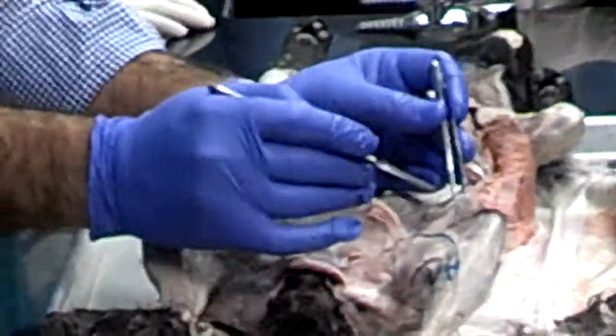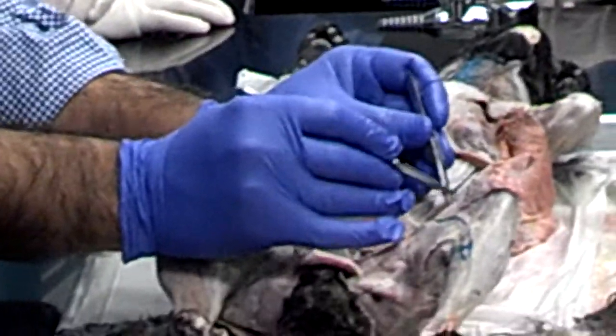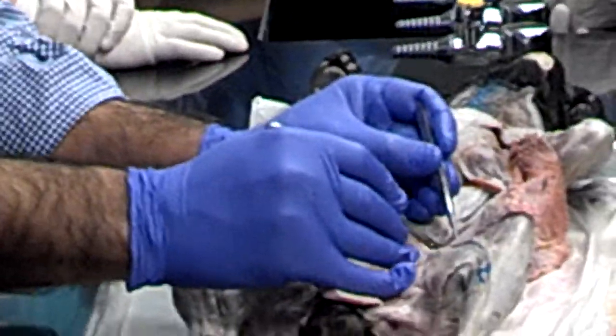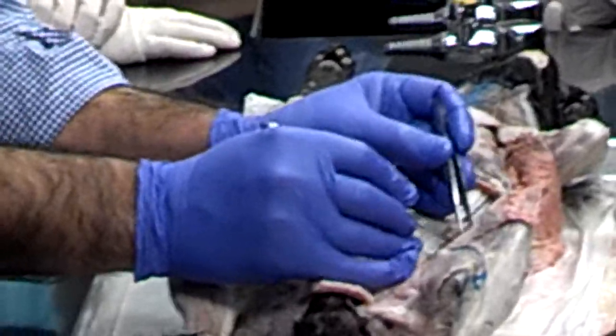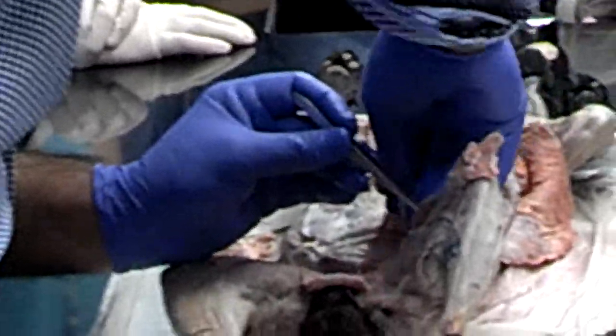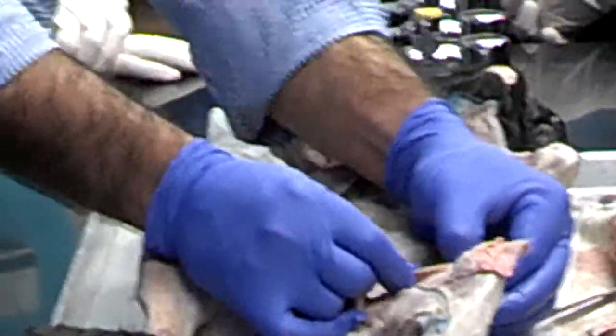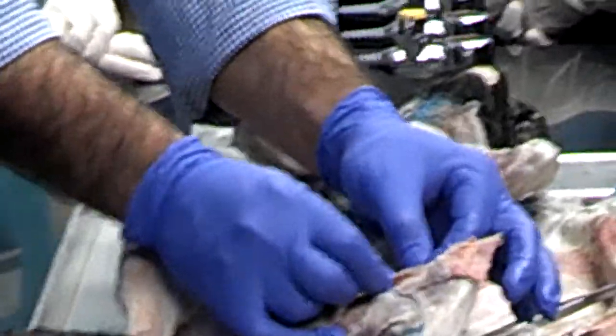Vastus lateralis is on the lateral side. Vastus medialis is on the medial side, and between these two muscles is your rectus femoris. It is sandwiched between two, looks kind of like a hamburger. I'm going to separate this. The rectus femoris is pretty shiny, you can clearly see that. So right here, this is your vastus medialis, this is your vastus lateralis, and right in the center is your rectus femoris.